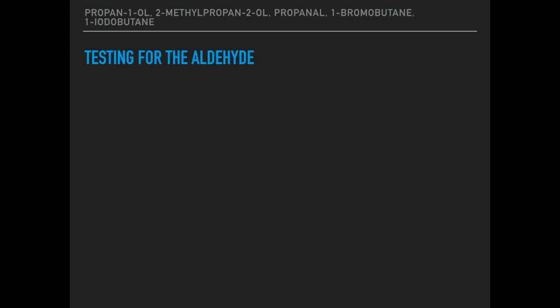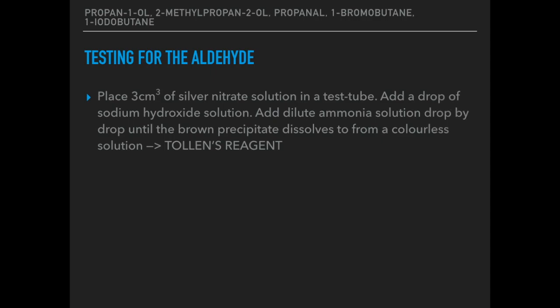The next test is for the aldehyde. The first thing you need to do is make the Tollens reagent. To make Tollens, add silver nitrate solution to a test tube — remember quantities aren't important. Add a drop of sodium hydroxide solution to the silver nitrate, which gives a brown precipitate. Dissolve this using dilute aqueous ammonia, adding it drop at a time until the brown precipitate dissolves to form a colourless solution. That is Tollens reagent.